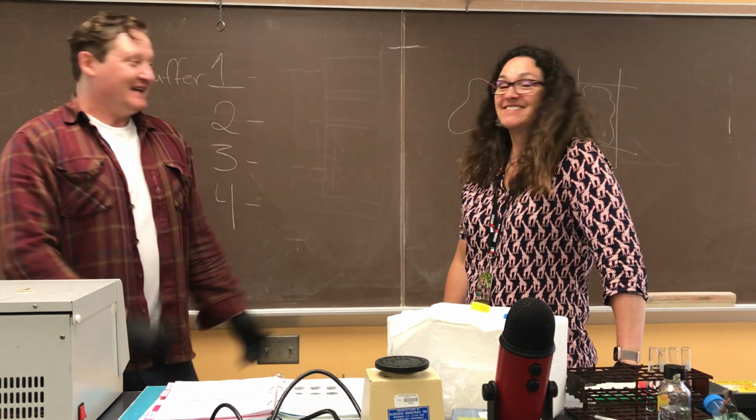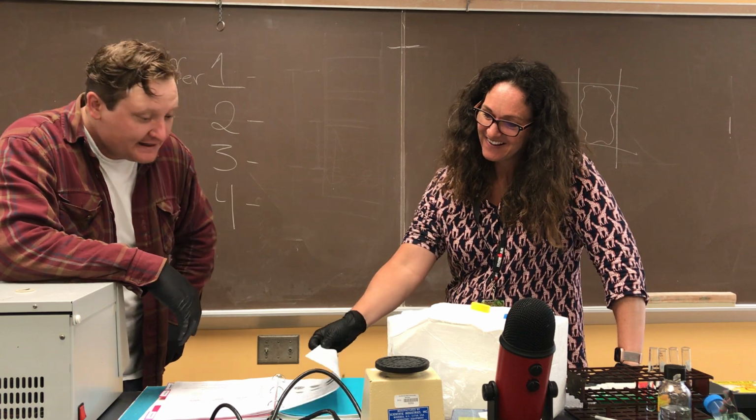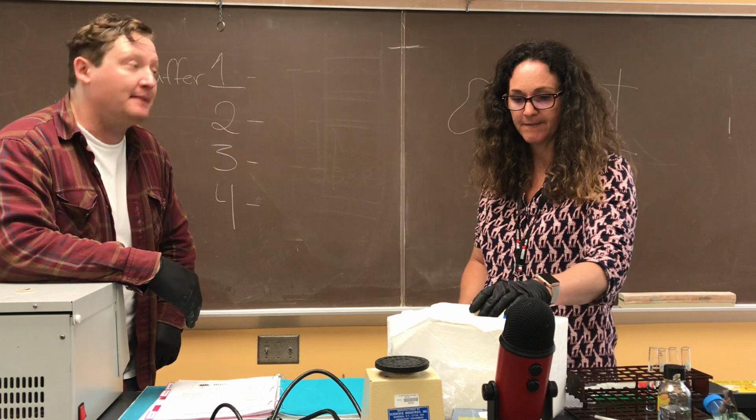All right. Hey, hello everyone. Welcome back, Bio 105 lab. We're doing the protein extraction and quantitation lab today. And there's a little bit of background information that we need to provide to make the lab make any sense at all.